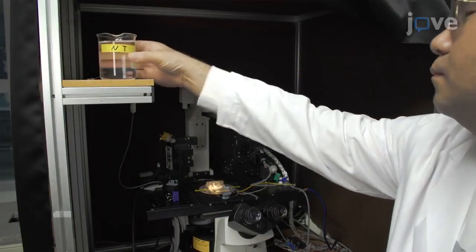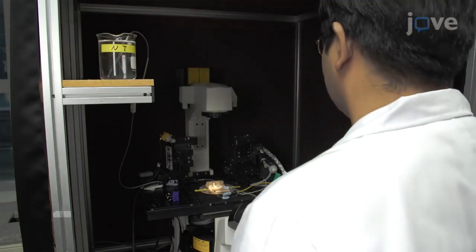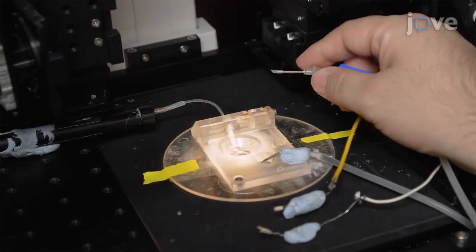In this procedure, place a container loaded with bathing solution above the patch clamp chamber. Next, fill the patch clamp chamber with the bathing solution by suctioning the tube.